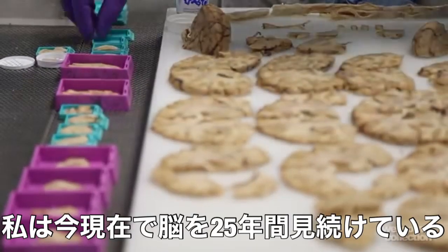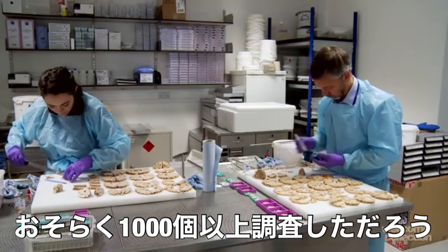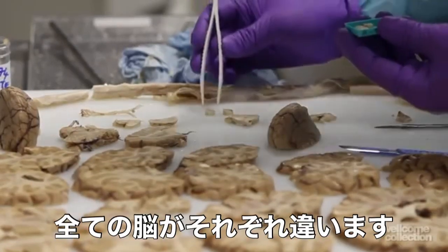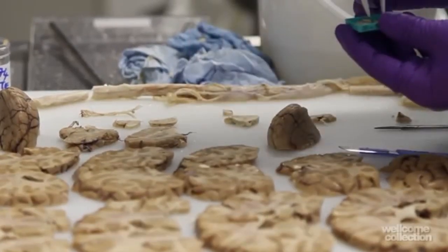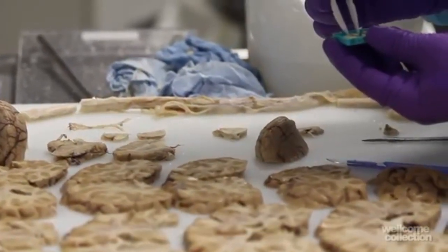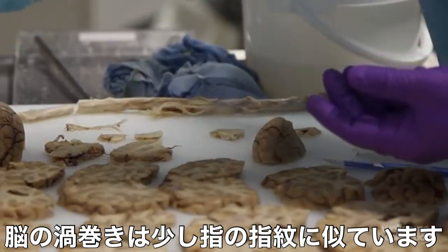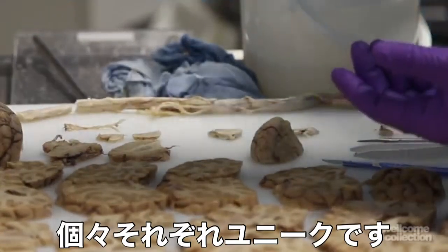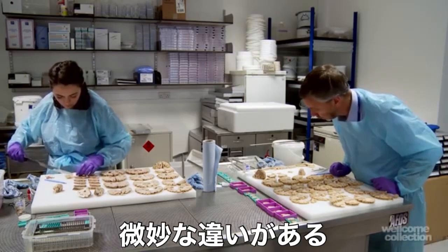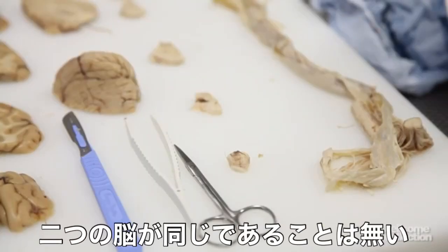I've been looking at brains for 25 years now, and I have probably examined over a thousand. Every brain is individual. When I first pick up the brain, what I'm looking at is the external features, and the convolutions of the brain are a little bit like a fingerprint — they're unique to the individual. Obviously they have a very similar general structure, but there are subtleties. We're all slightly different in our development, so no two brains are the same.